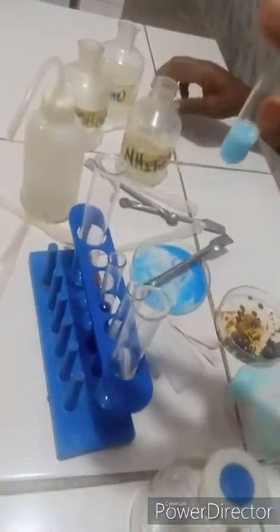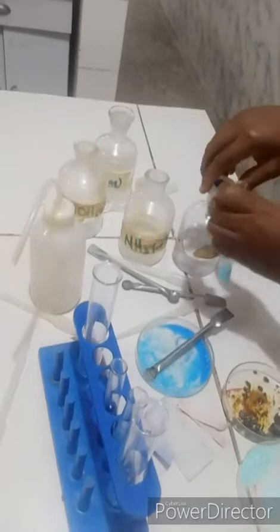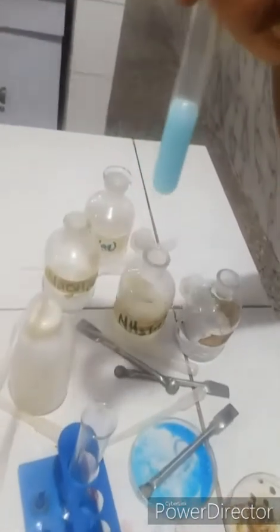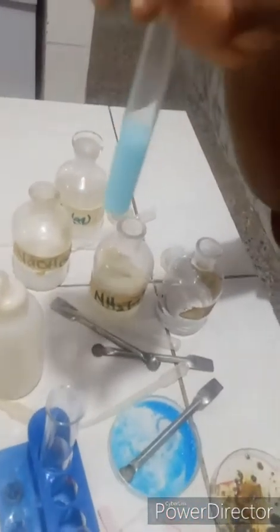The confirmatory test, we try to check whether the precipitate will dissolve or not. To do that, we add hydrochloric acid in excess quantity. Whenever you want to check whether a precipitate will dissolve or not, make sure you shake the solution. As you can see, the white precipitate is still there. And this shows that the anion present is not SO3 2-, it is SO4 2-.